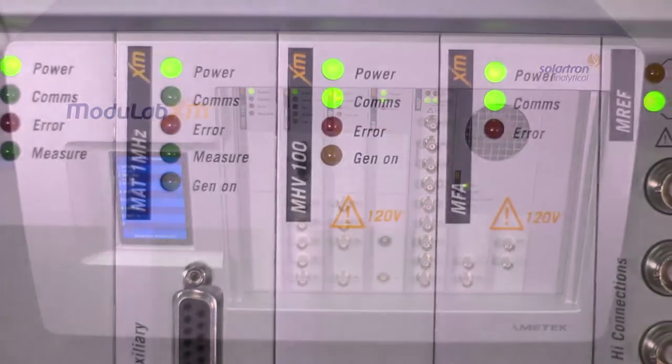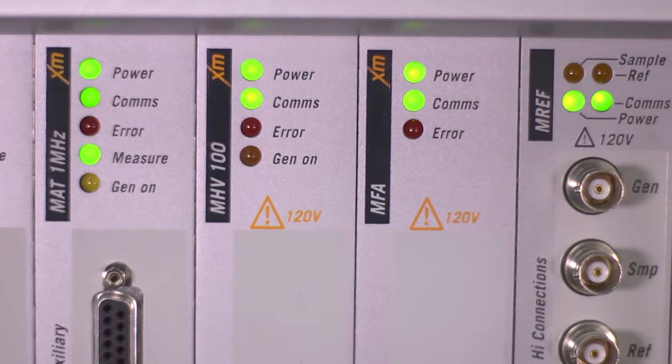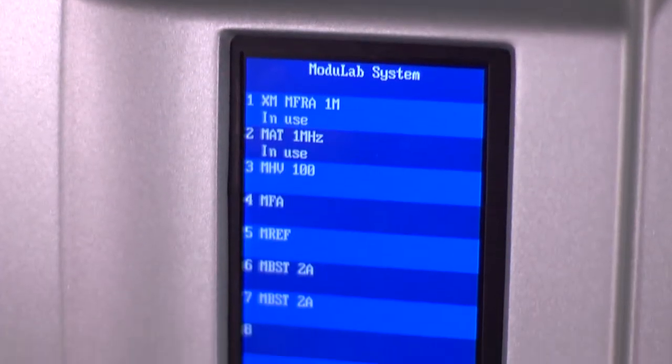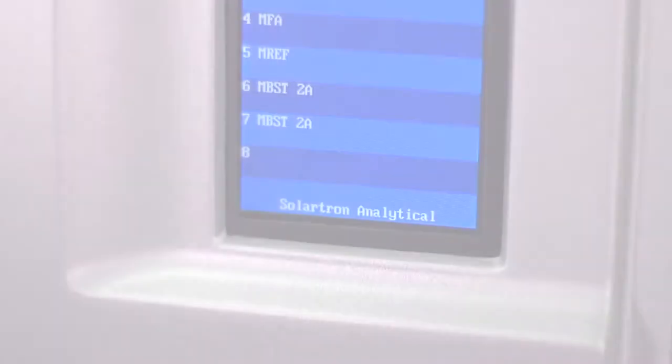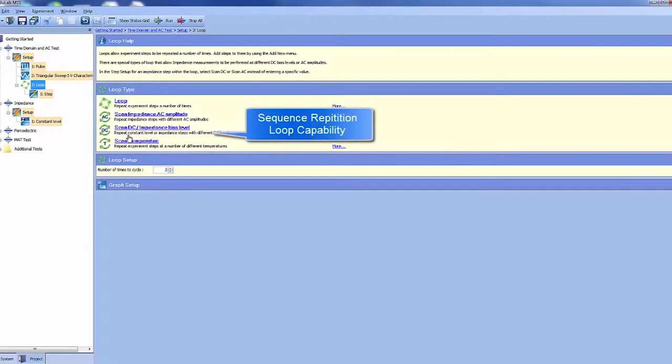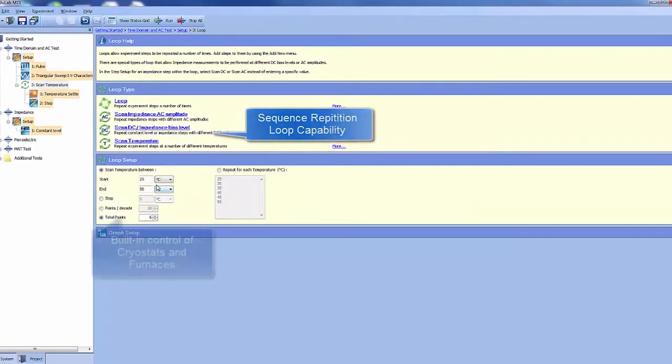Time domain and AC measurement, high impedance, low impedance, high and low voltage and current temperature control, all in one convenient system and all operating under the acclaimed Modulab software environment.